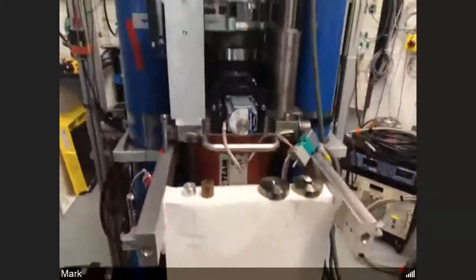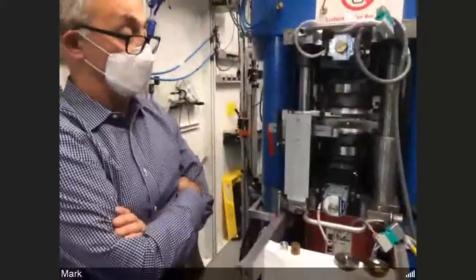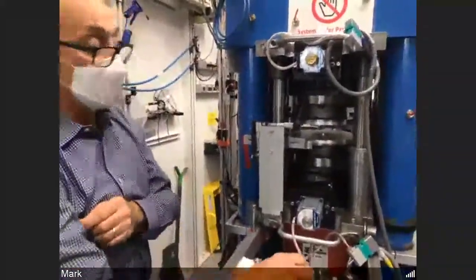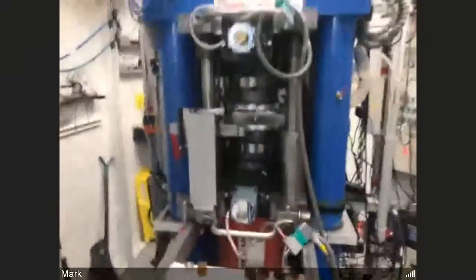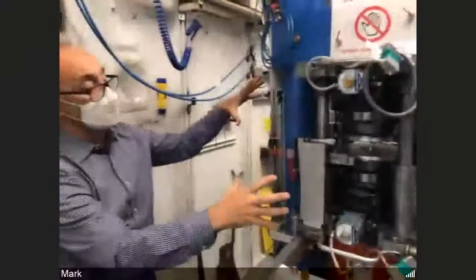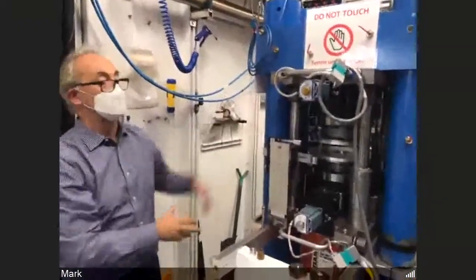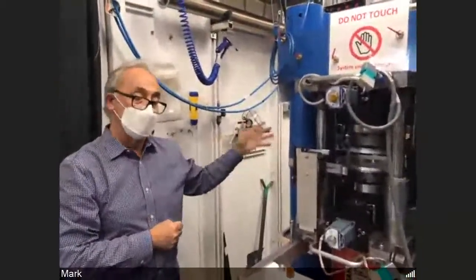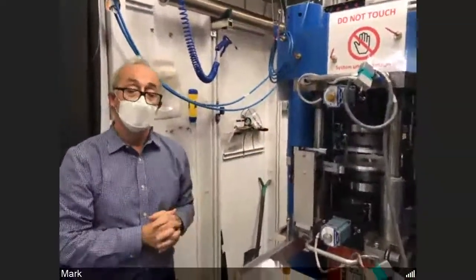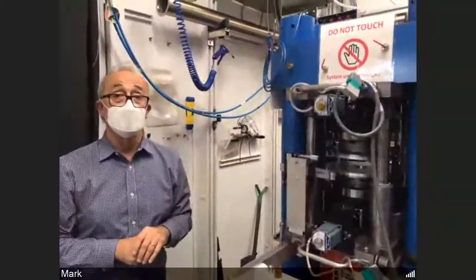We can't go to the full 250 tons with the rotation device, but we can get to significantly high pressures and high temperatures. And then there's another cell called the Paris-Edinburgh cell here for different types of experiments that can go in the same apparatus. And in this multi-anvil press, there's the capability of doing both imaging and X-ray diffraction. The X-ray diffraction is critical because that's how one measures what pressure you're at using some sort of a solid crystalline standard where you know what the lattice spacing is at a given pressure.